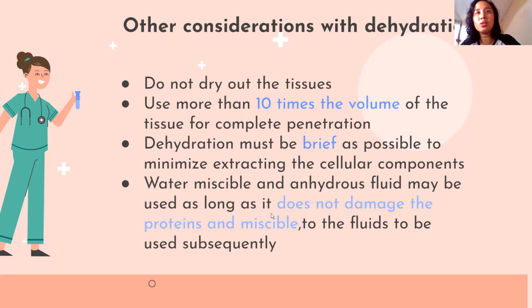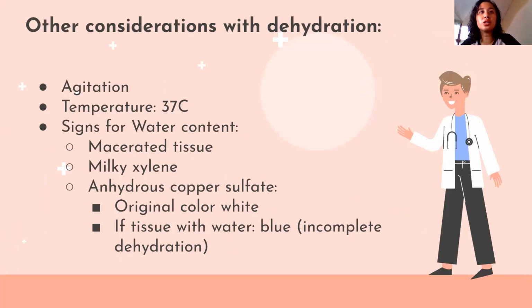So, since alcohol yung gagamitin natin, alcohols are miscible to the clearing agents. So, walang problema. Other considerations with dehydration: agitation hastens your dehydration. A body temperature of 37 degrees Celsius hastens your dehydration.